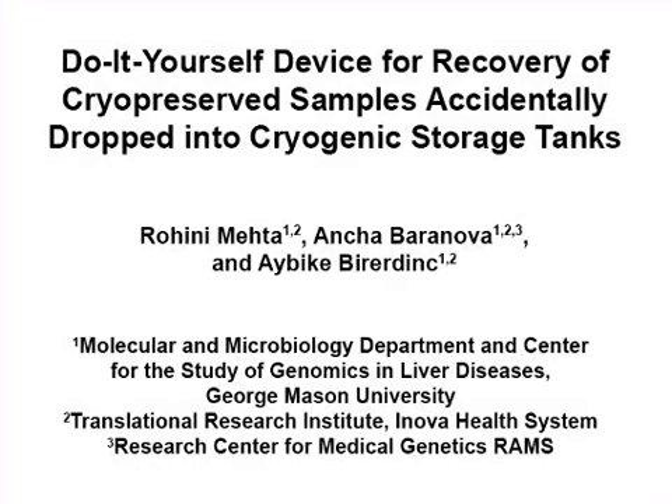The goal of this procedure is to ease retrieval of samples in cryo boxes and cryo vials from DUA tanks filled with liquid nitrogen using an easy to construct device.